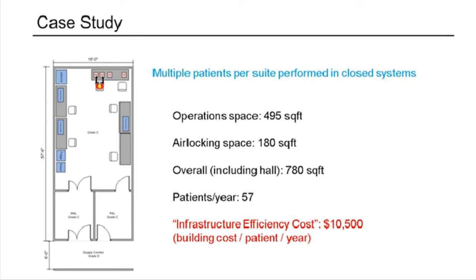And certainly with the grade C or ISO 8 space, there's other aspects to consider, things like lost time gowning into the higher classified space, reduced labor for the automated processes versus manual processing, the sampling regime for all the environmental viables, sterile material logistics.